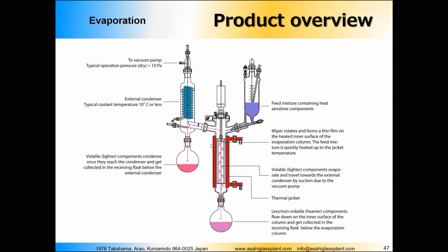Depending on the size, it can be 2, 4, maybe 5 seconds, up to maybe 10 seconds, depending on the viscosity of the media that you are inserting. So that's the advantage. You can easily concentrate the mixture of the thermolabile substances.